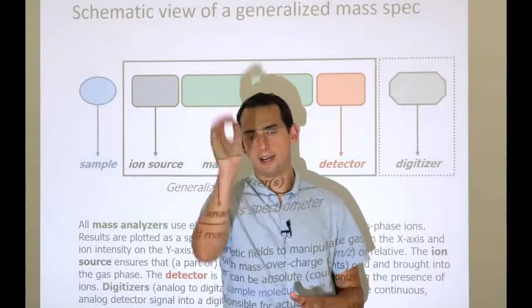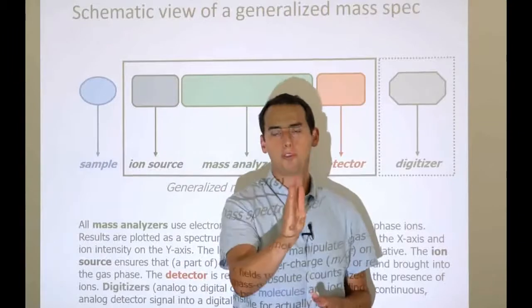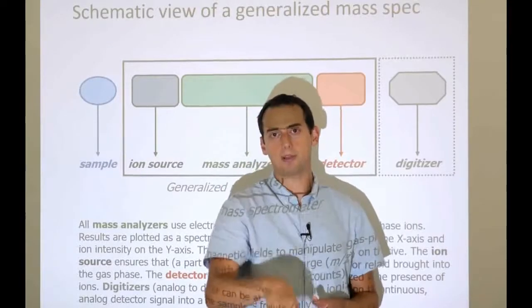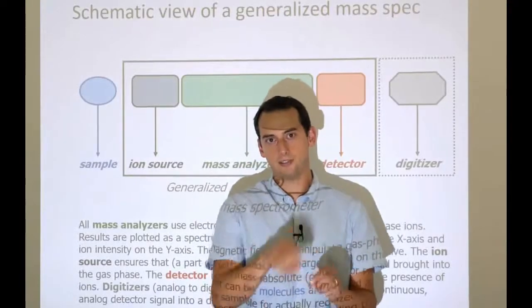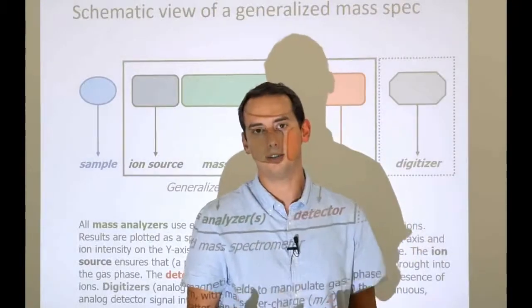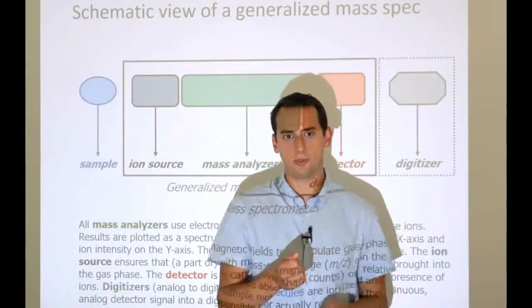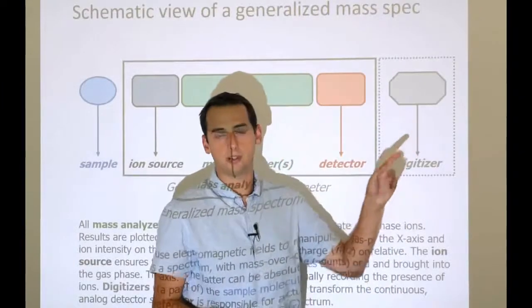So they check what the height of the signal is at a given time point, write that down, then move a time point on, take another sampling, write that down, and this set of discrete observations becomes your digital or discretized signal. Now, the speed at which this happens is really important, and that's where the digitizer comes in.